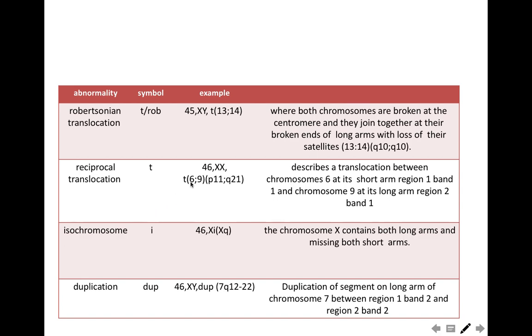بالنسبة للترانسلوكيشن احنا عارفين احنا عندنا two types of translocation. روبرتسونيان translocation بتحصل فقط في الاكروسنتريك كروموسومز اللي هما كروموسومز 13 14 15 21 and 22. في الحالة دي البريك اللي بيحصل في التو كروموسومز بيحصل at the centromere، فكل الكيو ارم بيلزق في الكيو ارم بتاع الكروموسوم التاني، يبقى عندي one single كروموسوم كبير لكنه بيحمل carries all genetic material of both chromosomes.